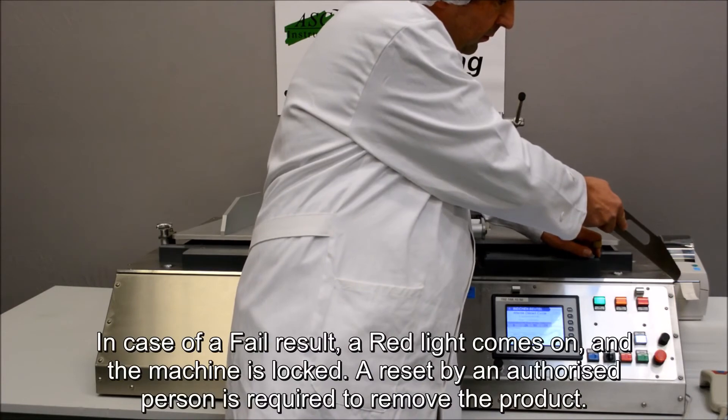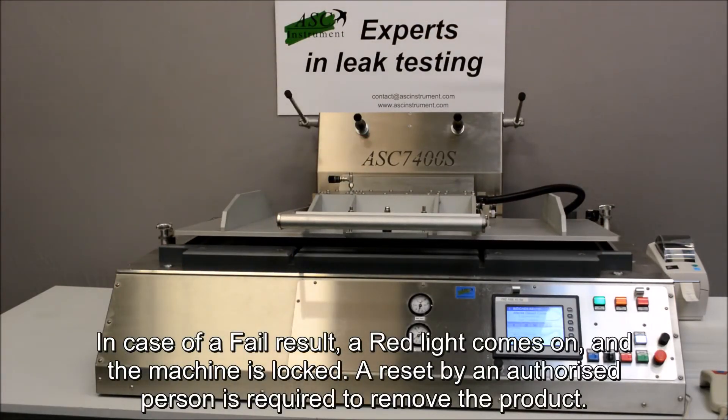In case of a fail result, a red light comes on and the machine is locked. A reset by an authorized person is required to remove the product.